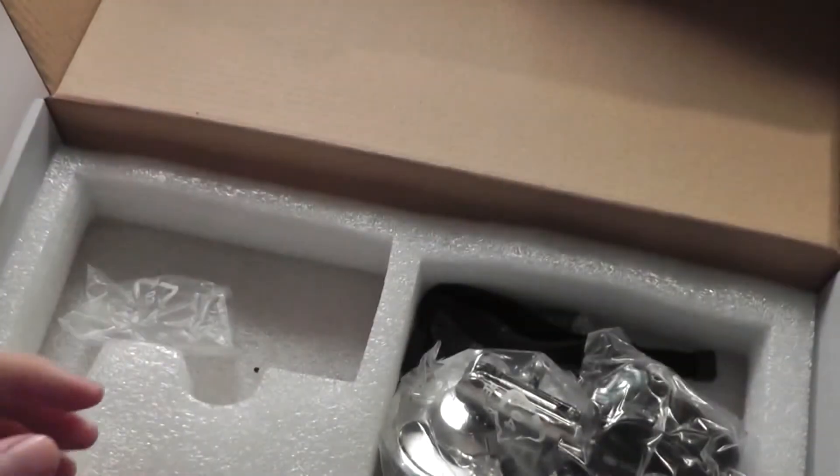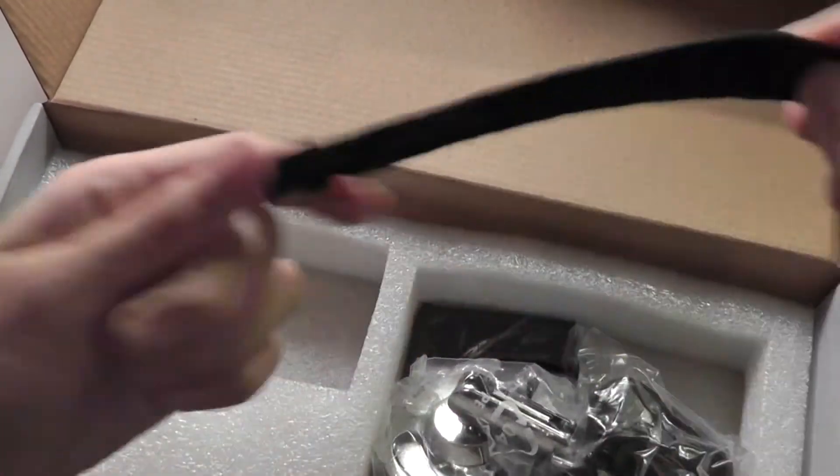This is the mini USB cable included for charging and syncing purposes with a computer or Mac. And this is the lanyard that's included.